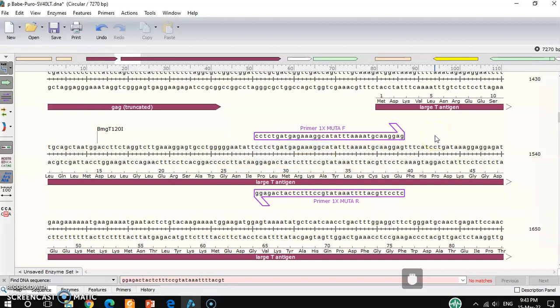So you can see right now, in this part of the primer there is no binding site. So in the primer, that part is deleted, so that part will not bind in the primer. So this is actually the right way to delete any part from your plasmid.